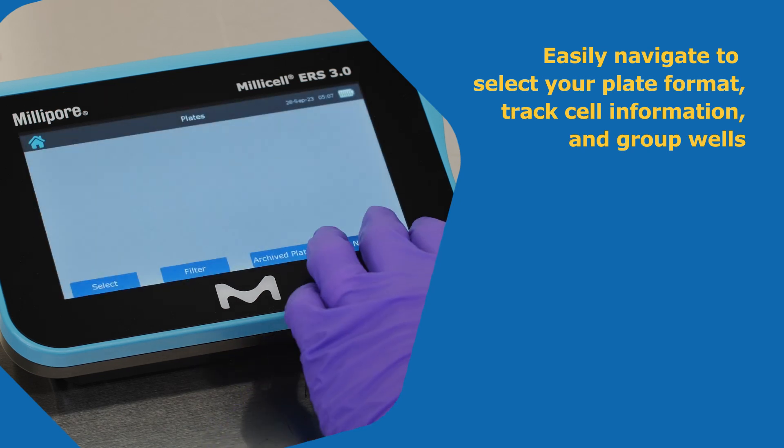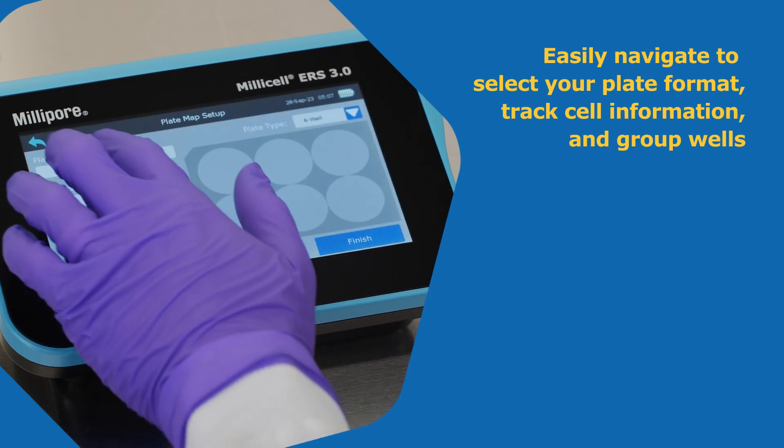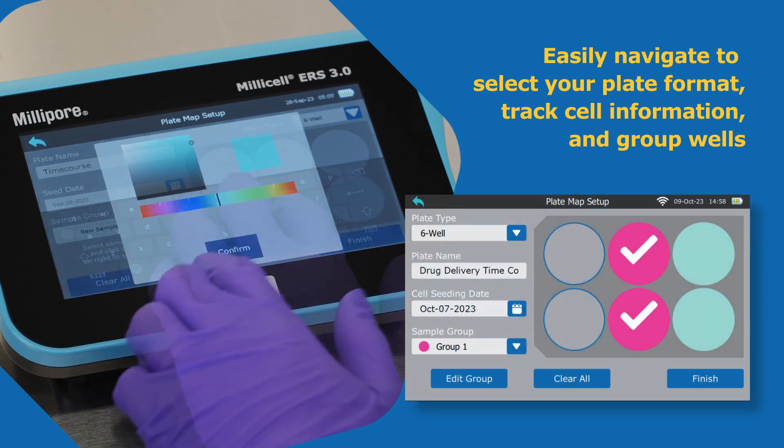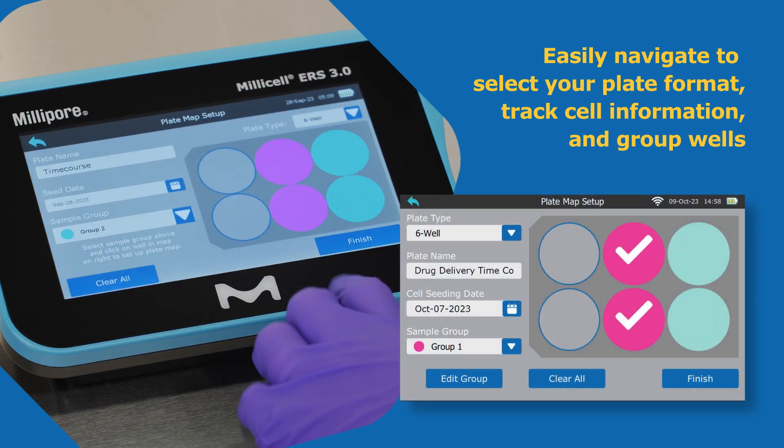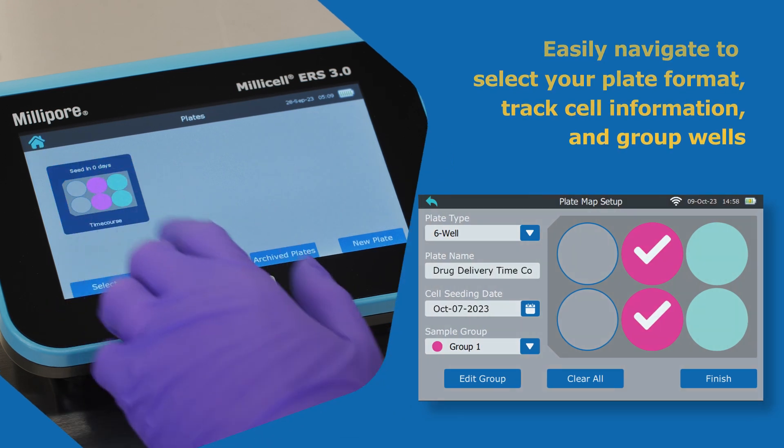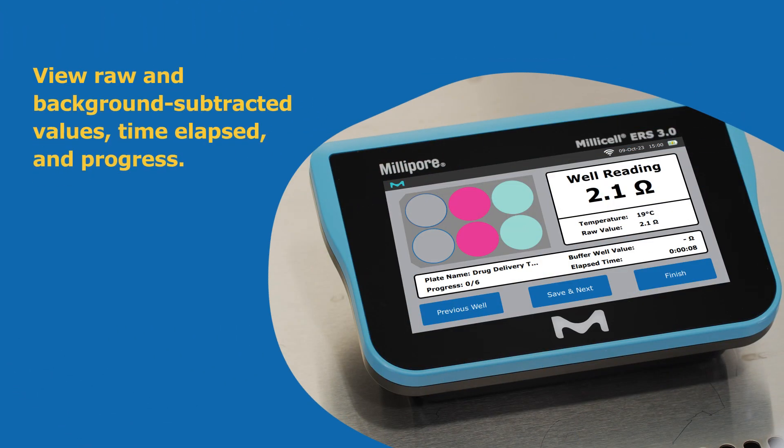Select your plate map, enter your cell information, and annotate wells for analysis. View raw and background-subtracted data, elapsed time, and experimental progress.